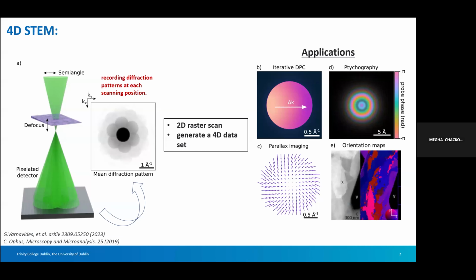Trinity College Dublin, and I'm working on developing low-cost, high-speed electron detectors for 4D STEM measurements. As you might be familiar, 4D STEM is an electron beam technique which uses an electron beam to scan across a sample. But when we compare this technique to a conventional STEM, 4D STEM is different, which collects not only the images, but also the diffraction patterns. And it is helpful for the spatial and angular information.